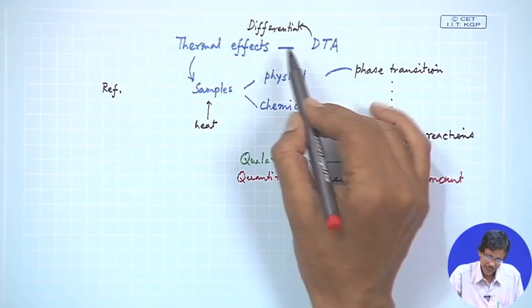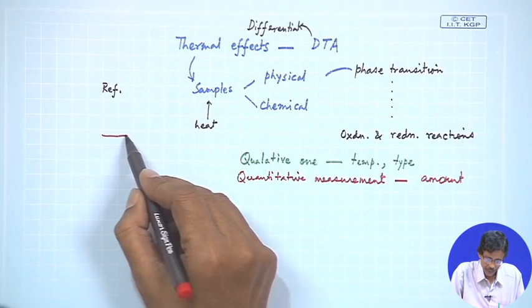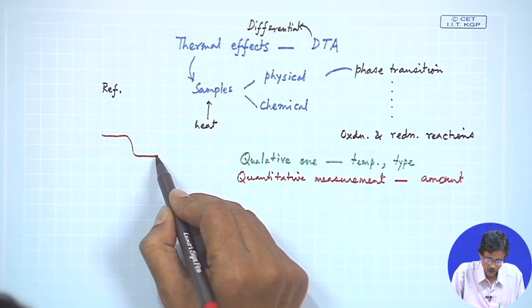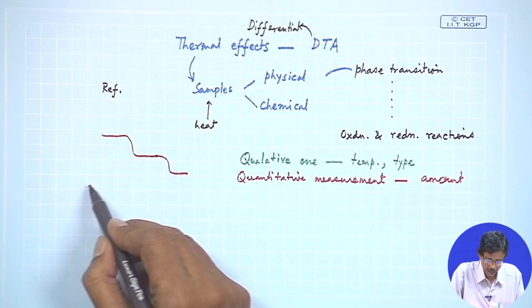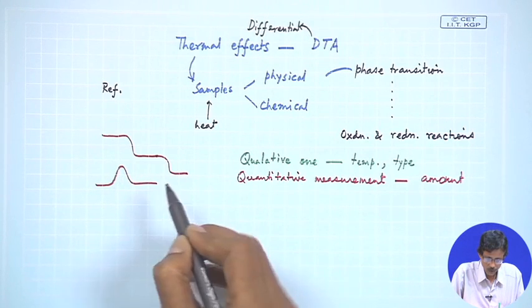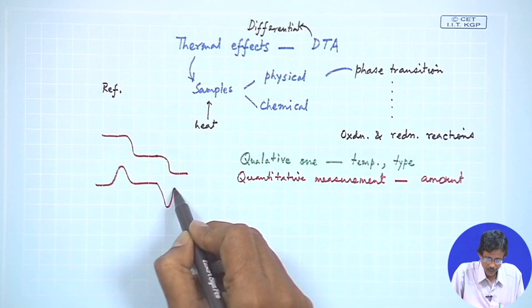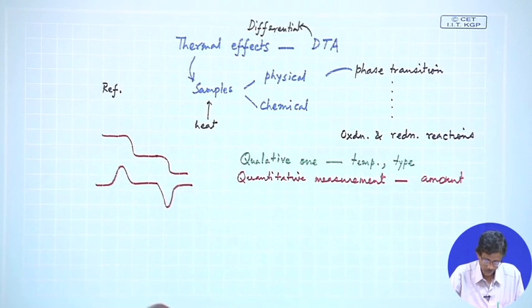So, what we see is that since this particular plot is a derivative one and we have seen that a corresponding TG plot is something like this only, and if we get some other type of plot, where some area can be bound for both these two different types of thing, one can be your exothermic one, another can be endothermic one.